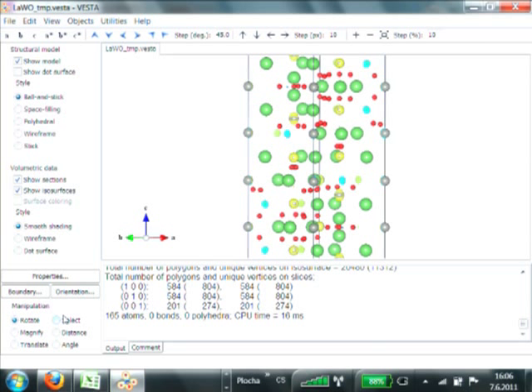All right, good. Well, we are essentially finished. So what I would do is delete the oxygens, refine, and we would get an R value of something like 5%, and the structure would be finished in about 2 minutes from now. But I won't do it. It is, again, in the tutorial, and so you are welcome to try it on your own.